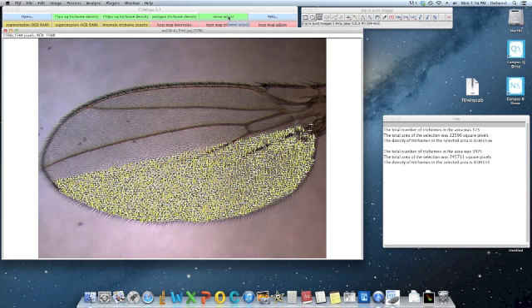Finally, a noise adjust button here allows the user to set the noise, where the default noise is set at 10.